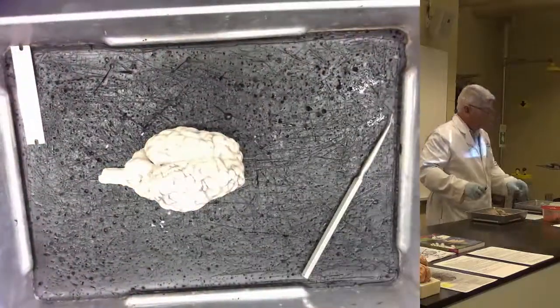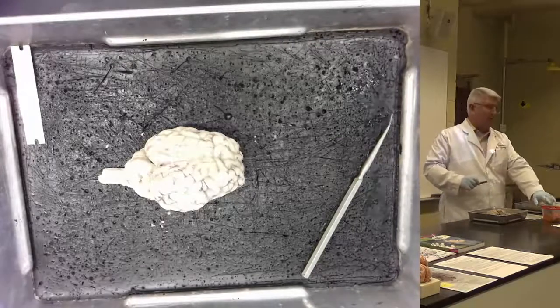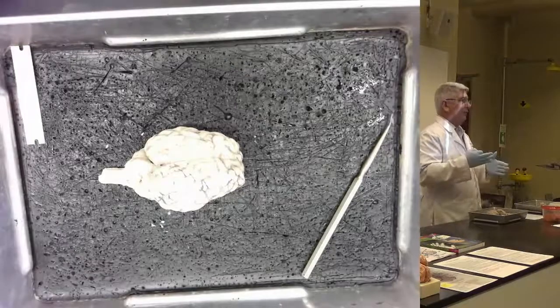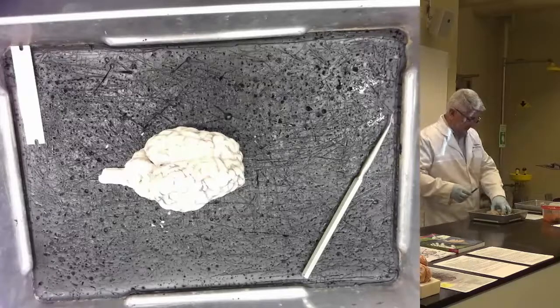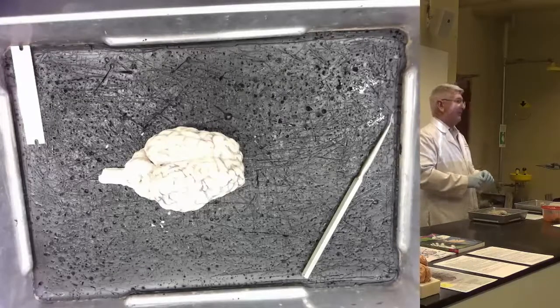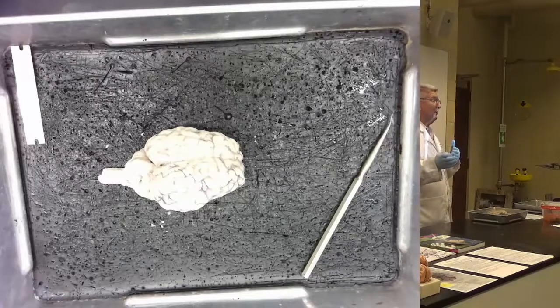And then I made coronal cuts for everybody, so every station has a coronal cut brain in a Tupperware jar there, and it's in order obviously from front to back. What's real important today, like I've been saying in the past, is that you look at lots of different brain slices. So you may start out with yours in your station because you know the order that it's in, so you can kind of tell front to back.